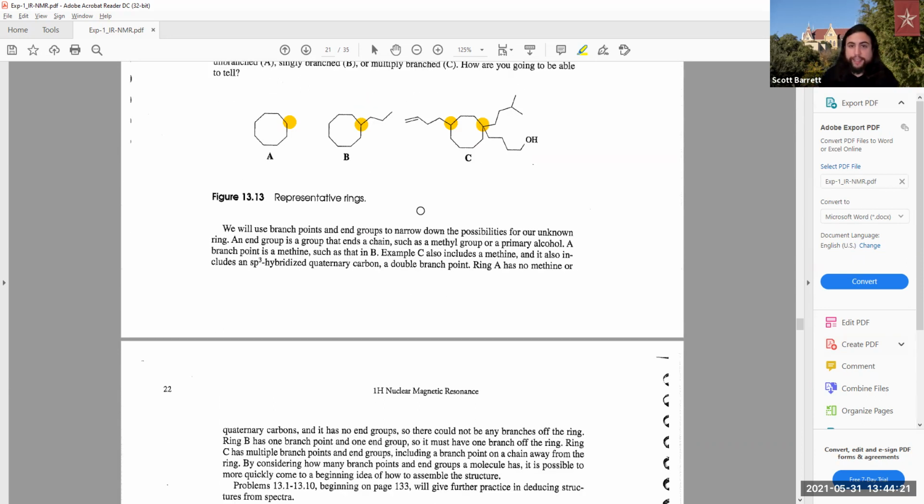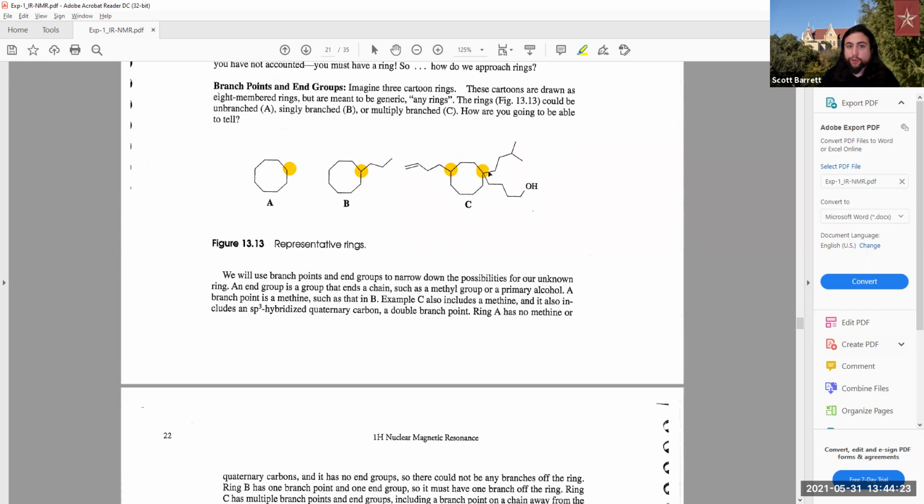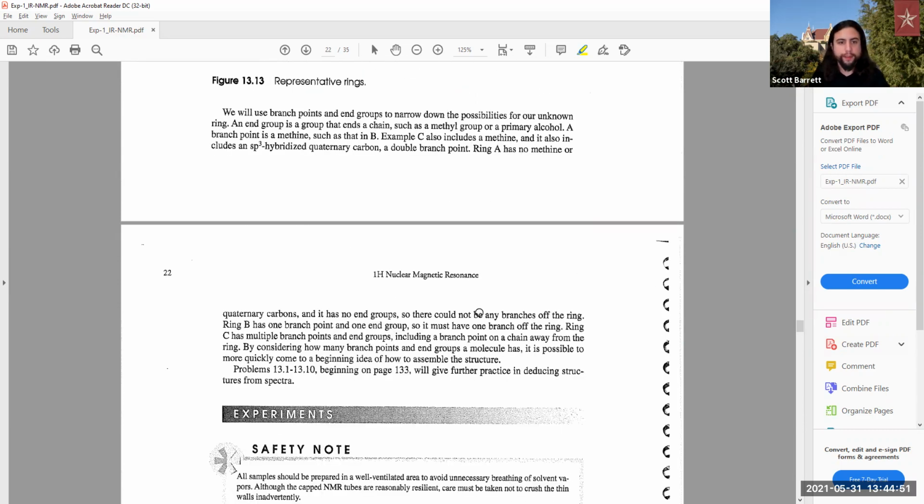In this case, ring C has your quaternary carbon, which you would never see protons from because it's quaternary attached, so there's no hydrogen there to analyze. But there's a hydrogen here on group B, and there's definitely a ton of hydrogens here on group A. That's how you can analyze across different NMR spectra, by noting where we should look, what our compounds look like, and how we can separate them from each other.